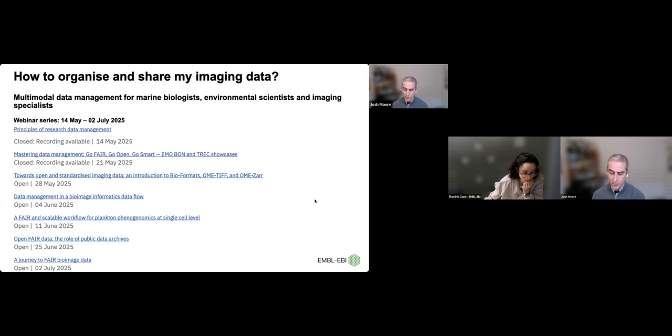There's a page on the OME-TIFF documentation where we list people who have added support for exporting OME-TIFF to their software and have told us about it. So we don't necessarily know everyone, but there are over a dozen different companies that provide OME-TIFF export to varying degrees of validation. So it's not always true that when you get one from the company that it will validate. There are some companies that are starting to talk about exporting to OME-Zarr, but it's very early days. So we end up providing the tools to do most of that.